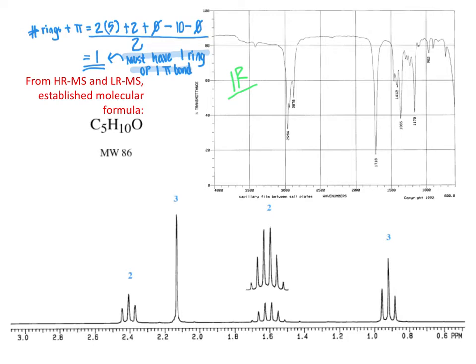The two main types of functional groups that we should be able to spot easily in IR spectra are hydroxy groups, which show up as broad, tongue-like signals because they dip down and are very broad, in this region around 3,000 wave numbers, depending upon whether that hydroxy group is part of an alcohol or part of a carboxylic acid. We see no evidence for a broad tongue-like signal here, and so what that tells me is that there are no hydroxy groups present within this molecule.